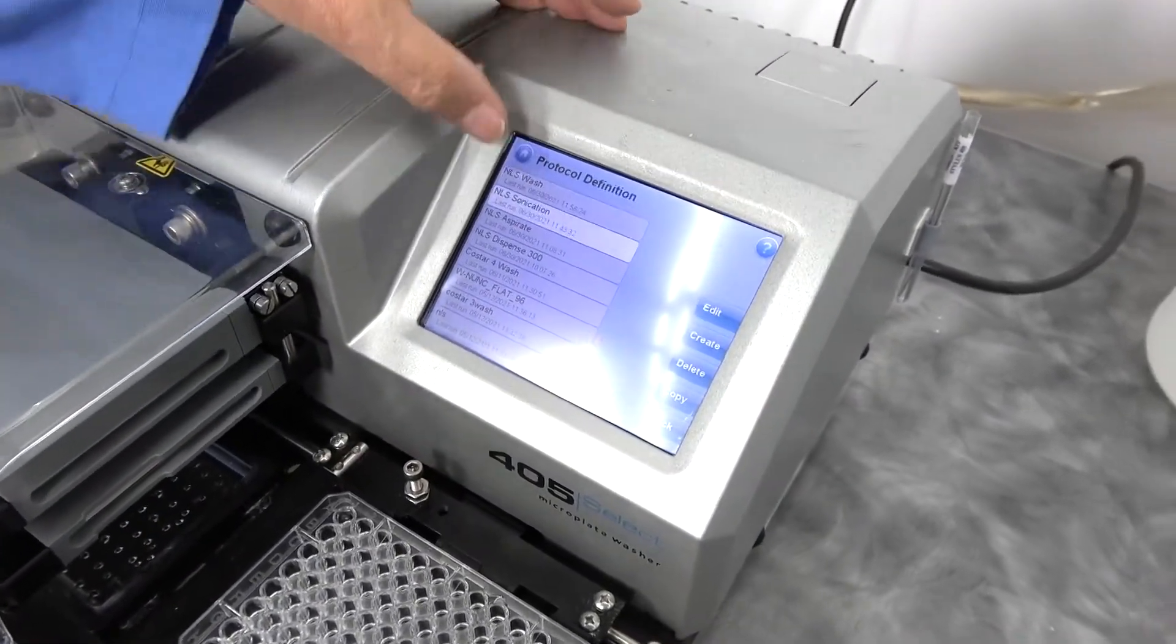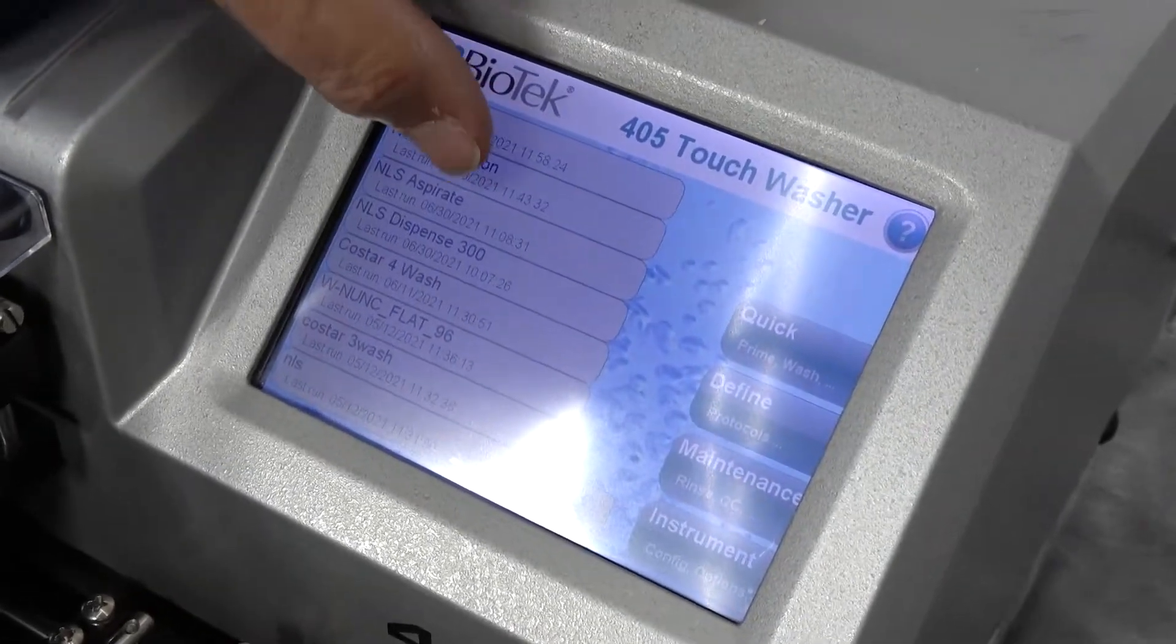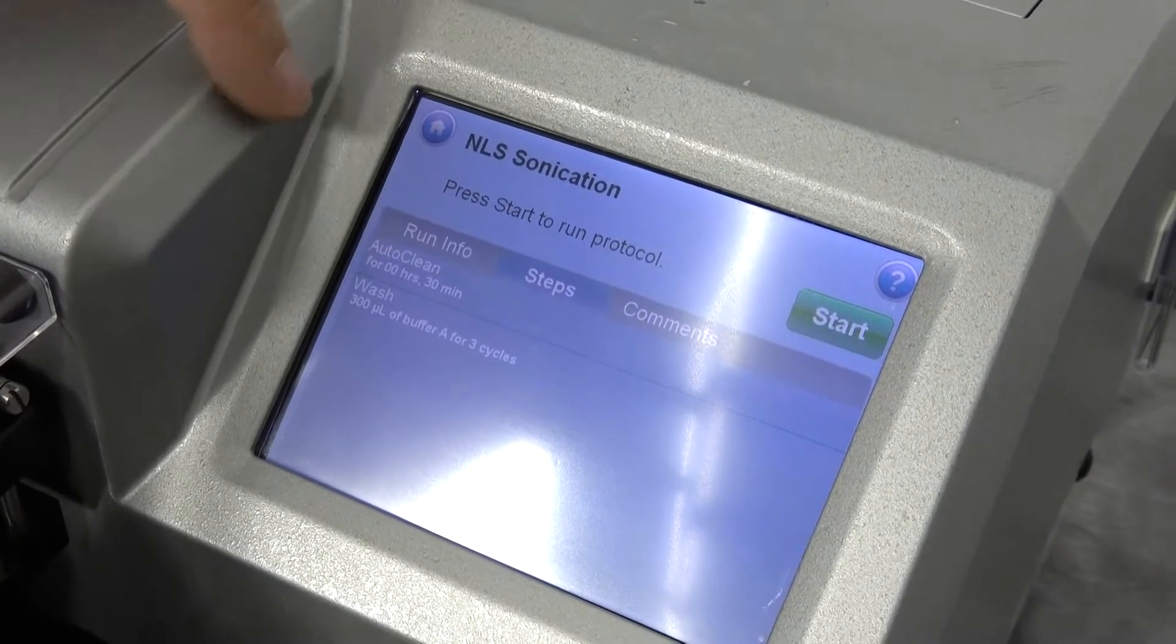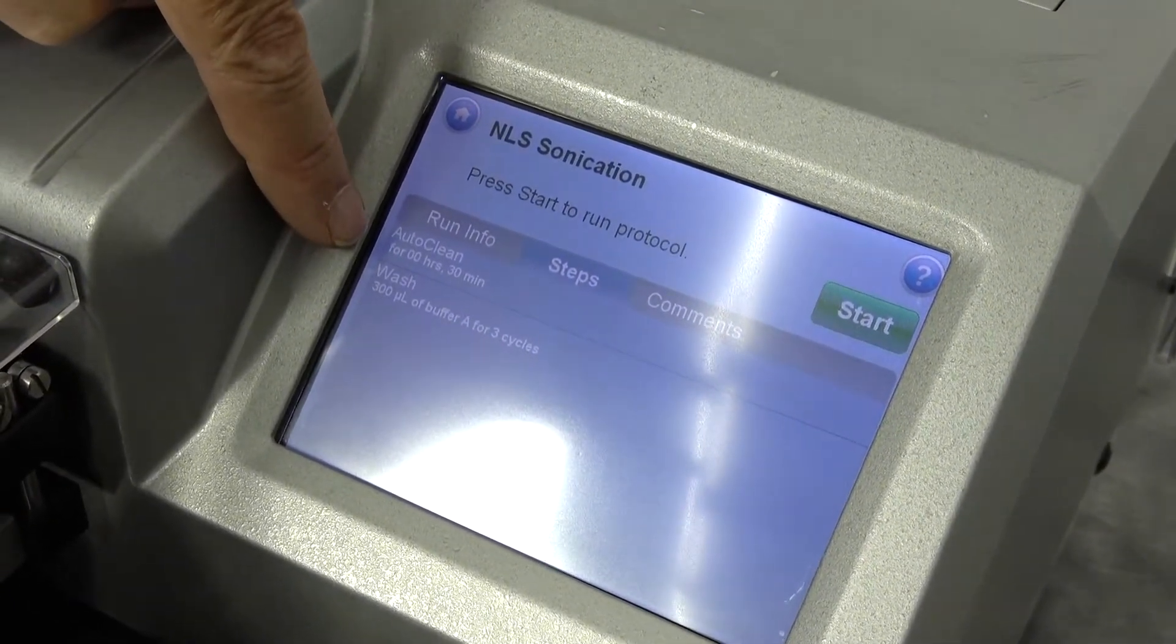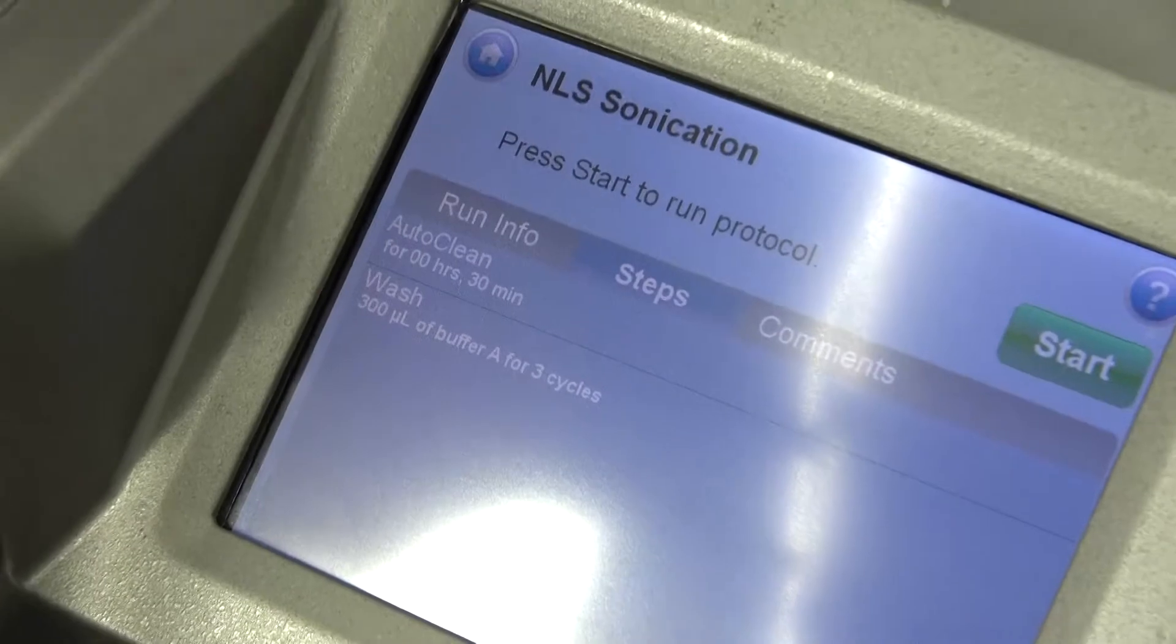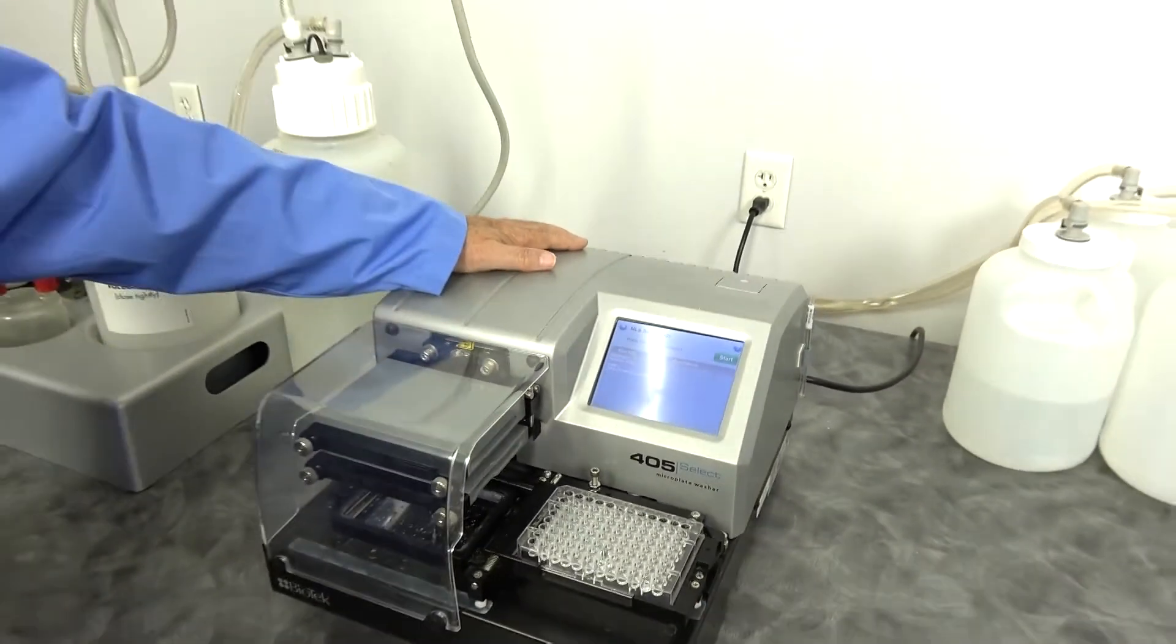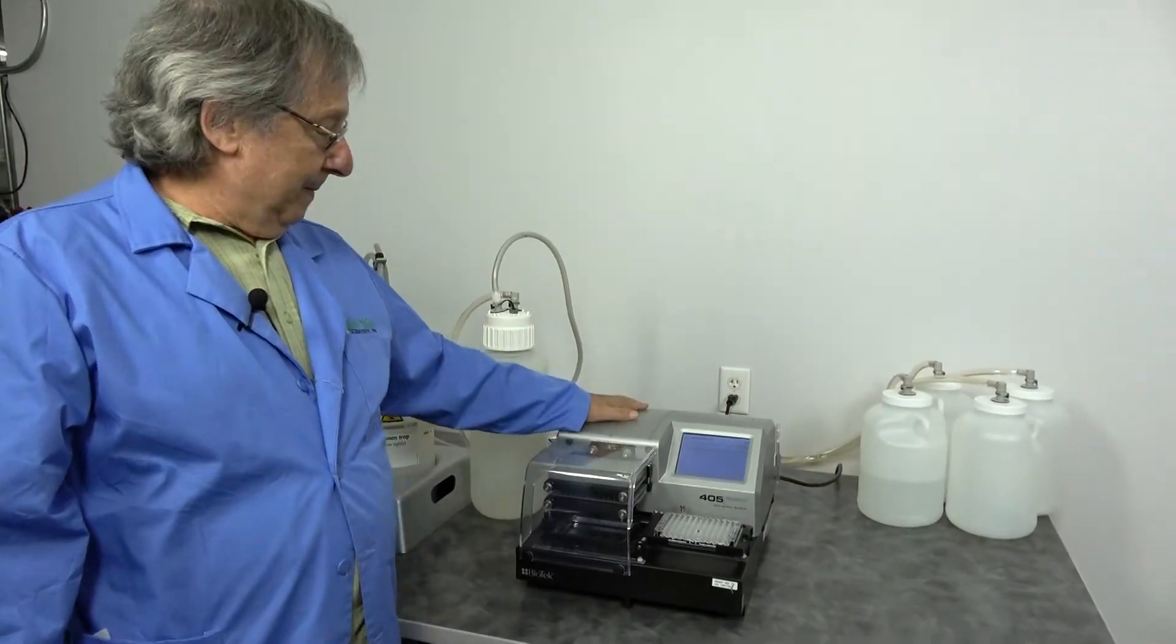Again, very easy to use. Push button operation. You can set it. We set this one up ourselves. It's a 30-minute. You can set them up for one minute to hours on end. So that's the Biotech EL405TS. Thank you very much.